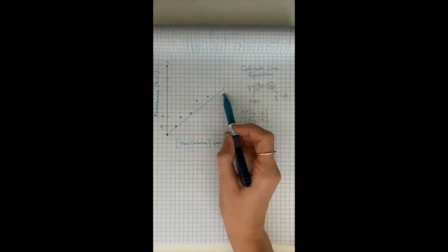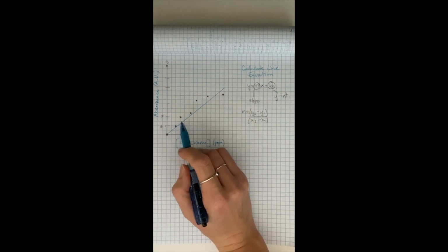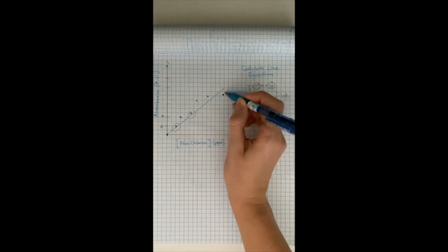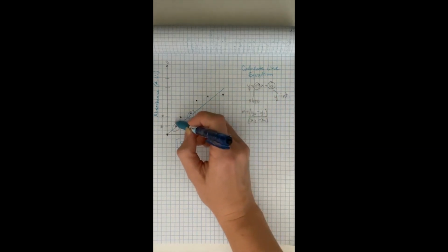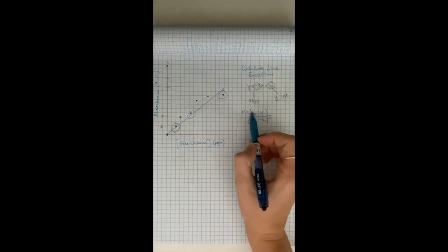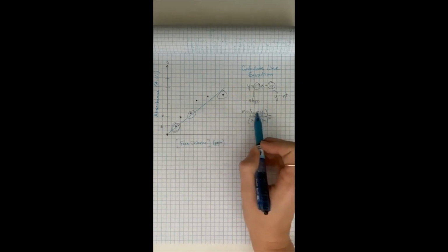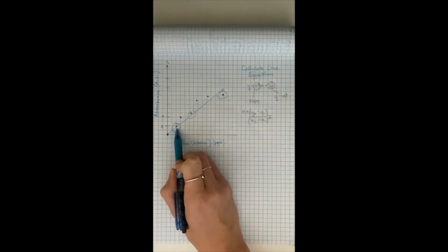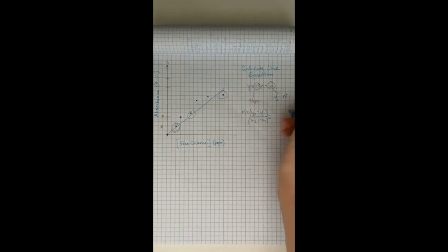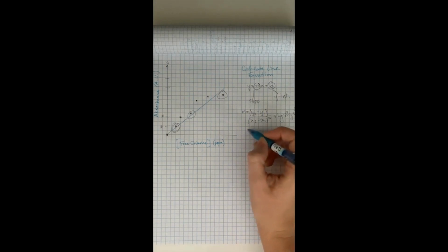So we are going to take, generally you want to do 2 points that are close to the line, and they're kind of far apart. So you could pick maybe these two, or this one I would say is close enough, so you could do this one and this one, and you're going to plug those values in. So we would plug the absorbance value for this one here minus the absorbance value for this point here, divided by the concentration minus the concentration. And then you're going to make sure you keep your sig figs in mind. They're important. So that will be your M, and then you can plug that in. And then you're going to have your B that you can solve for.